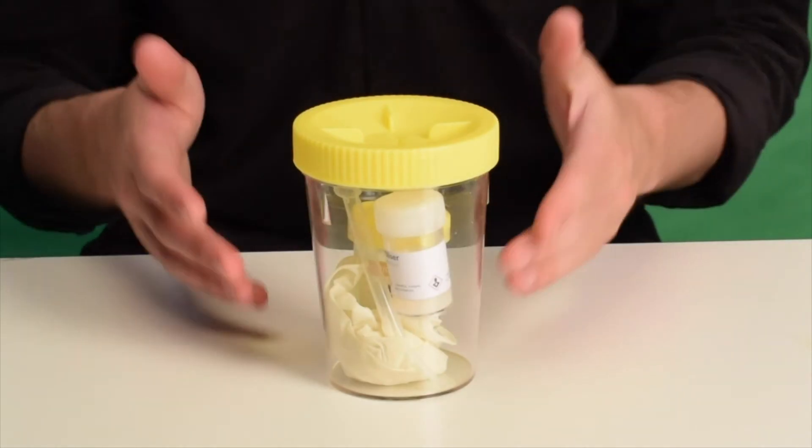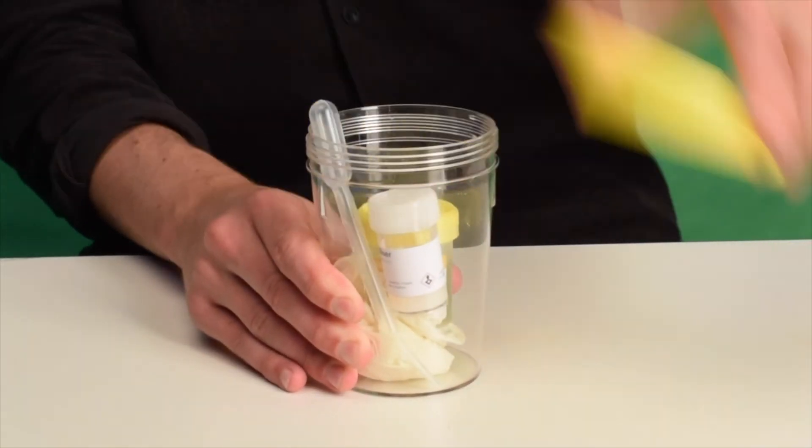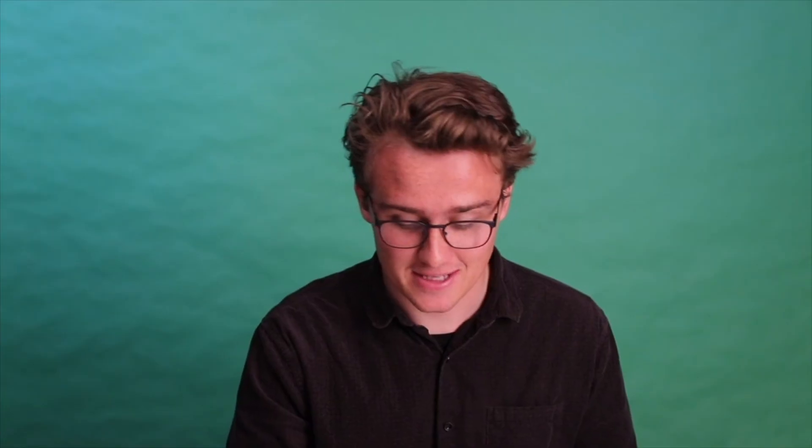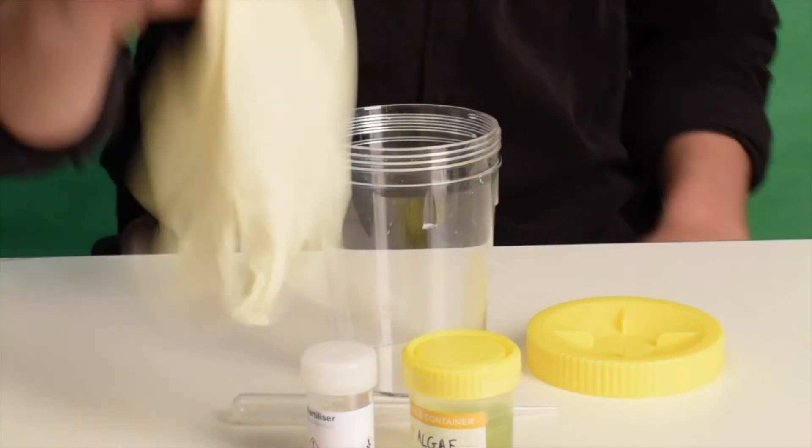Now let's explore everything that we have in the kit. First, we have the main container — this is where we'll first grow algae. When we open this up, the first thing that pops out is our plastic pipette. This is what we'll use to measure out samples for everything in the kit. Then you'll see inside there are two small containers. The smallest container is your algae fertilizer, and the green one — you guessed it — is your algae. And finally, on the inside, we have two safety gloves.